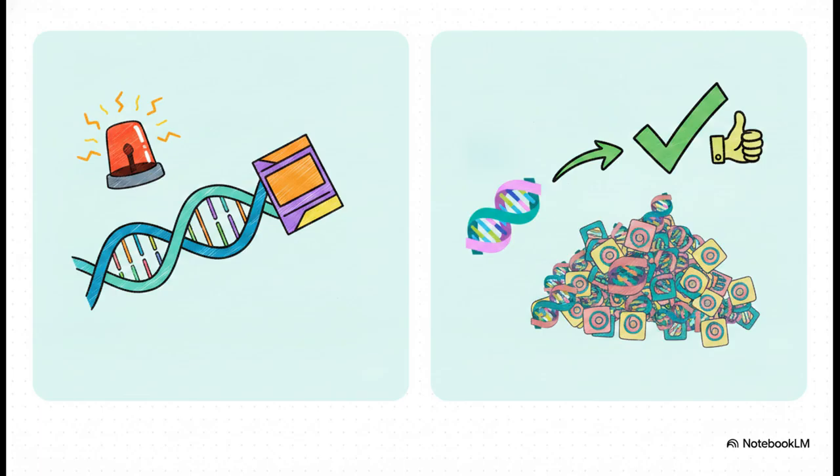But what if you find millions of duplicate copies of the exact same sequence? Well, in RNA-seq, that's often totally normal biology. Remember, a highly active gene naturally pumps out thousands of identical photocopies, so duplicates aren't always bad news.